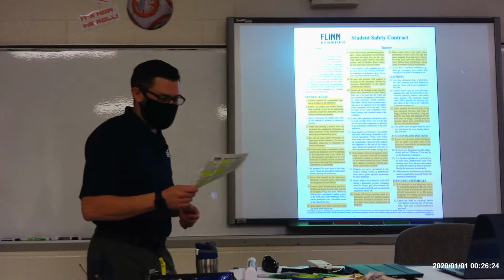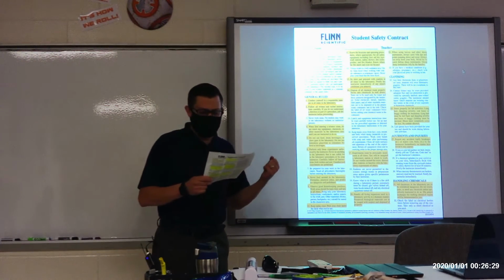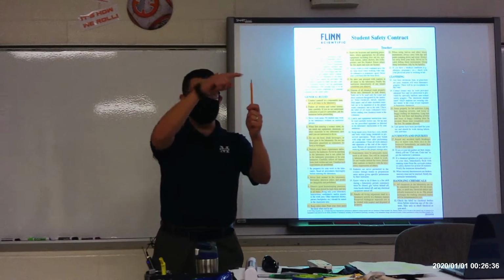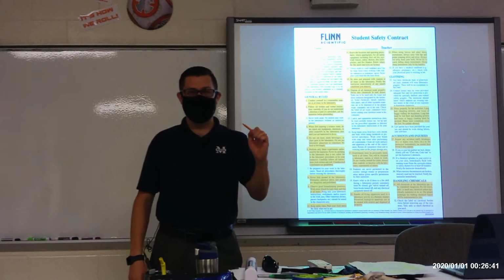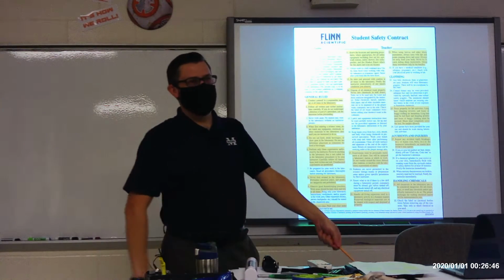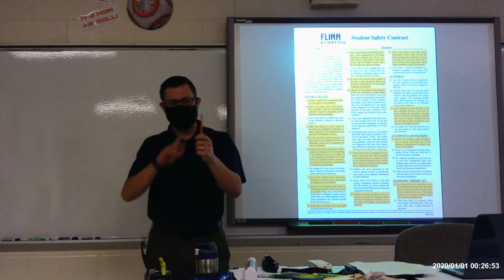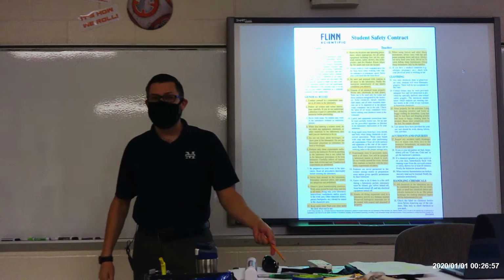All right, number 21. When using knives and other sharp instruments, always carry with the tip pointing downwards and away. Okay, if this pencil is a scalpel, we want the tip of that scalpel pointing away from your body, because if it's pointing towards your body and you slip, that's going into you. And you want it pointed down, because if you're holding it up like this and you bump into somebody, you're stabbing them. Okay, that would be bad. So you always want the tip down and away from your body because you're less likely to injure somebody that way.